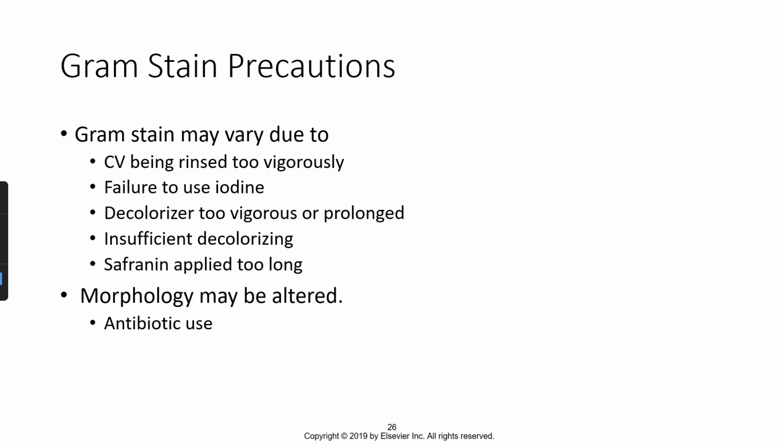So when you're studying this and you're preparing for not only this upcoming test, but also your qualifying exam, you want to know the ins and outs of the gram stain enough so that if I were to give you an error or something that you did wrong with the gram stain, you would be able to predict what the outcome would be. So I just gave you a bunch of examples of things that can go wrong and what the cells would actually look like in the end. You need to be able to read a scenario and figure out would the cells be clear, would they be pink, would they all be purple, would the cells not be there at all. So thinking through and learning this gram staining procedure enough so that you can answer those situational based questions is going to be important.